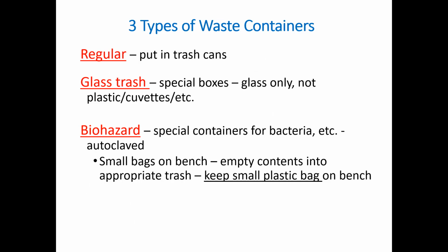In the lab, we have 3 types of waste containers. The first one is regular trash, several bins around the classroom. Most trash will go in there. There's a special glass trash box, which is labeled. Again, only glass, not plastic or cuvettes, etc. No paper towels. We have to pick that out if you put that in, and that does not make us happy.